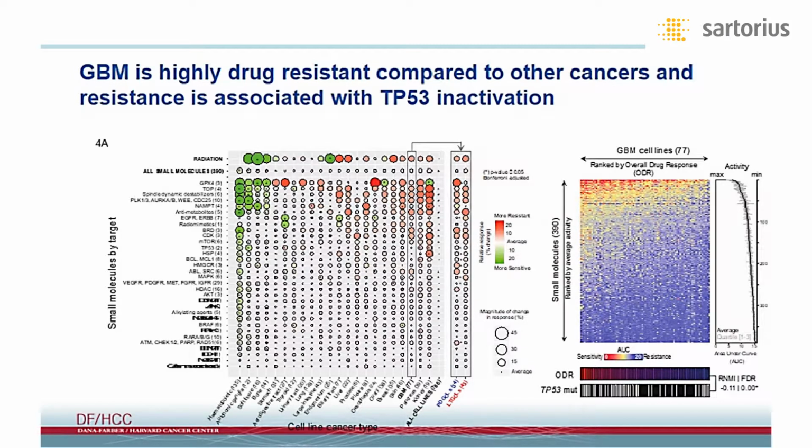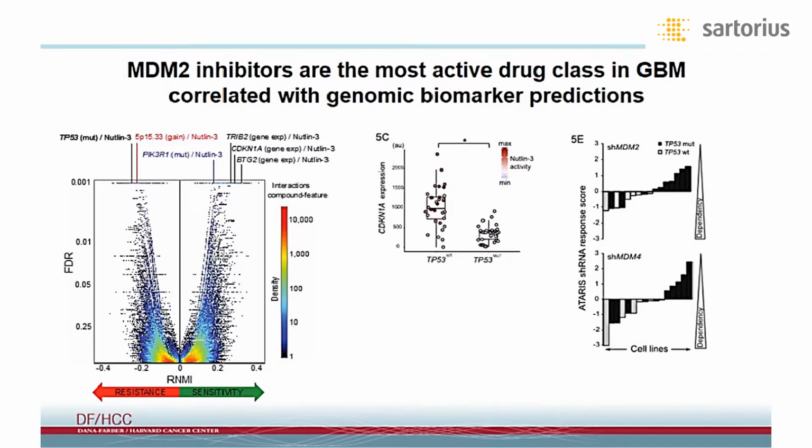What was interesting was that looking overall, we saw resistance correlated best with P53 mutation status. P53 showed, in both the 3D and 2D model sets, a great correlation with resistance to any type of agent. So this was something that we didn't expect and was very interesting.